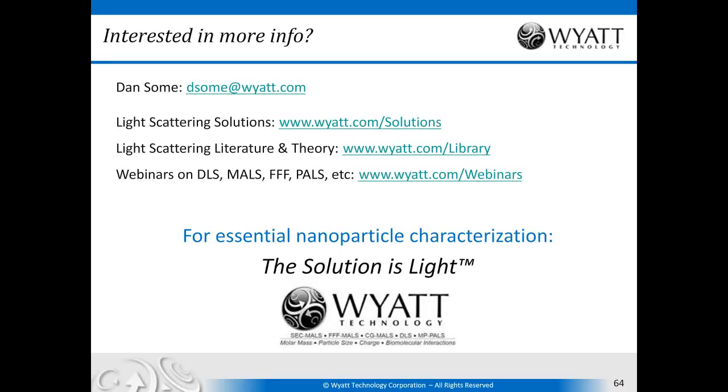So here's our protein and modifier. Using the 3-detector technique, you can get the molar mass of the protein and the molar mass of the modifier. If you have an additional protein encapsulated in the nanodisc, then obviously you'll see a change in the protein molecular weight relative to the modifier molecular weight, and that should give you your answer.